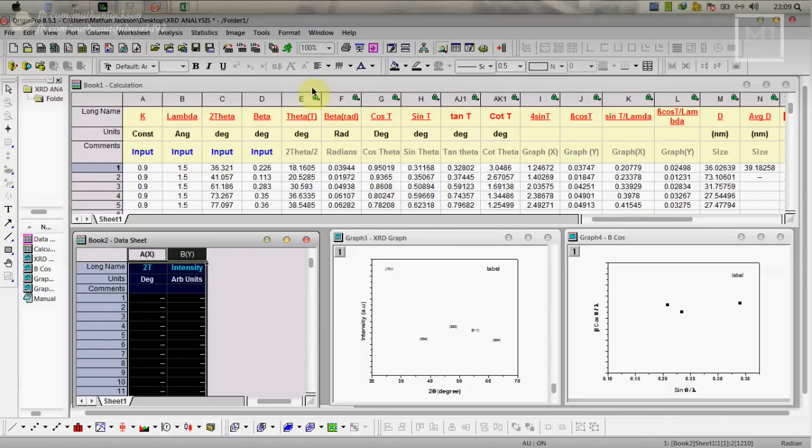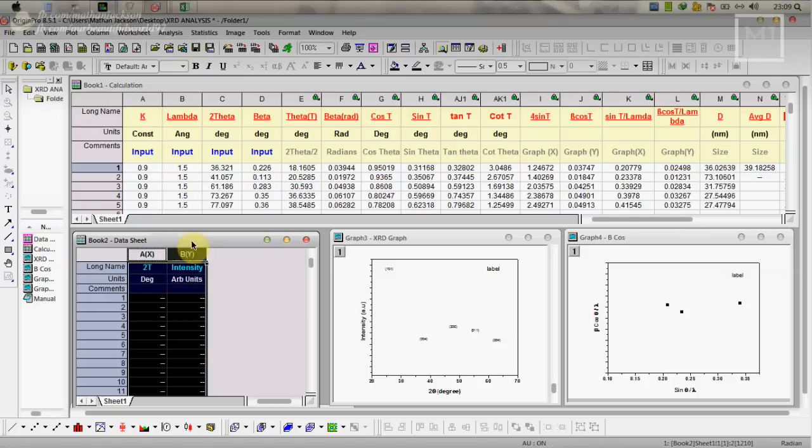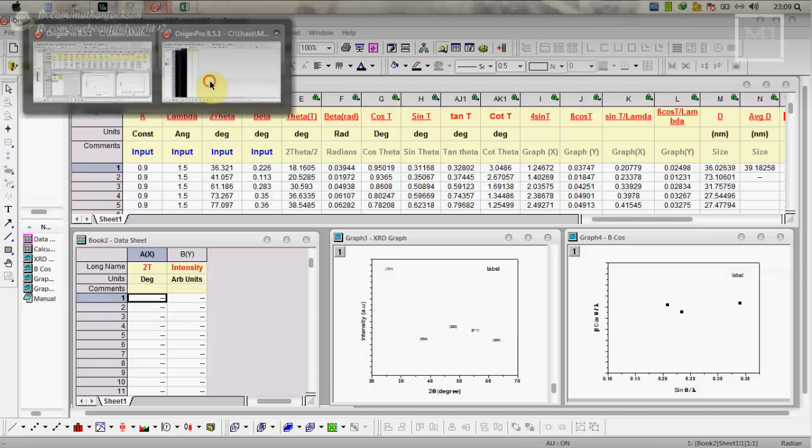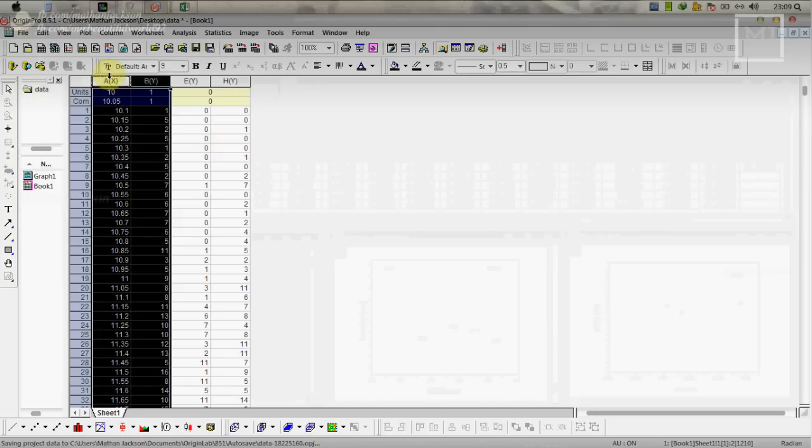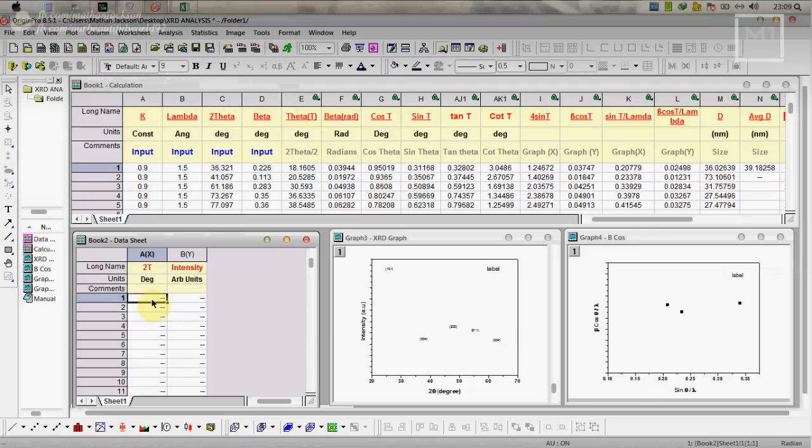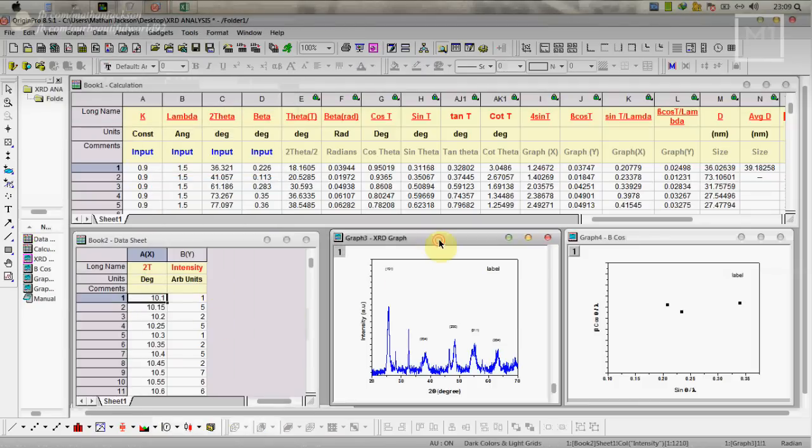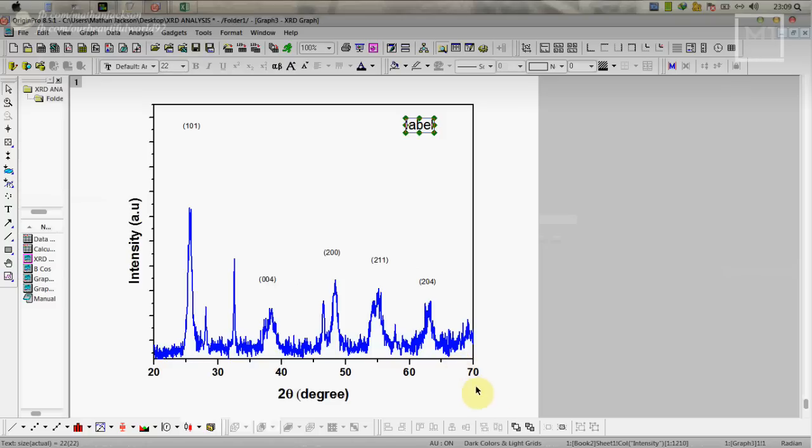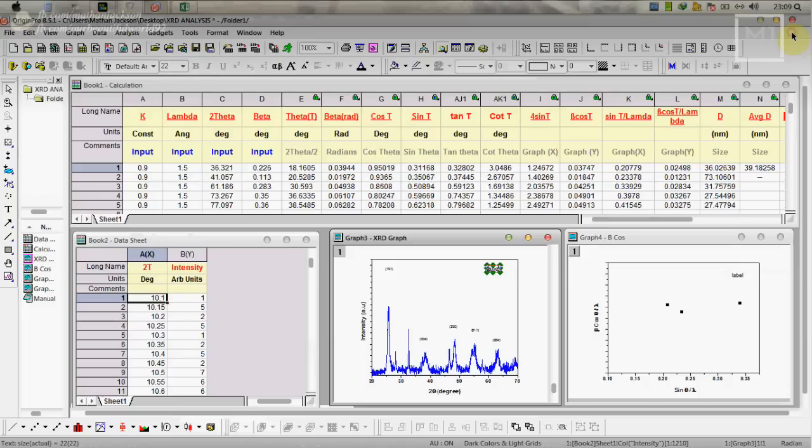After the calculation part is over we have to plot the graph. For that we have to give inputs here. This input we obtain from this data sheet. Just copy this and paste it here, we'll obtain graph here. In this graph you have to replace HKL values according to your peak values. Give your label here and everything is set. Do rescaling for your graph and some smoothening. Minimize this and go to file.